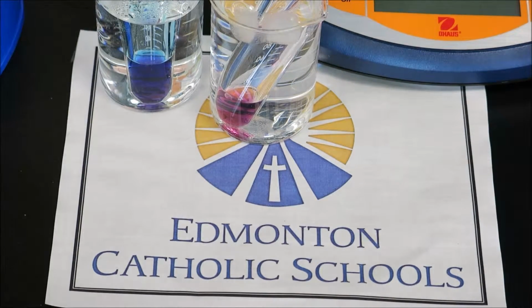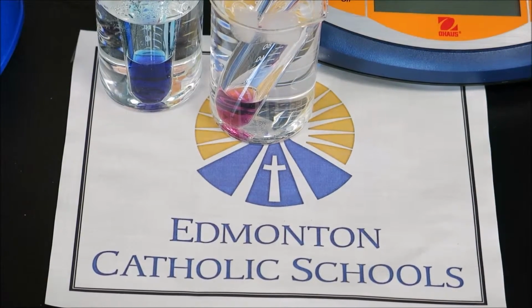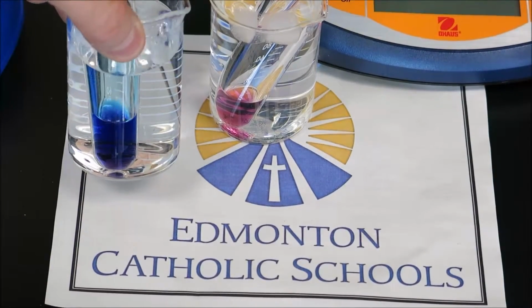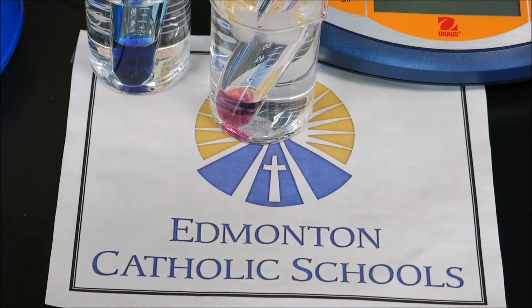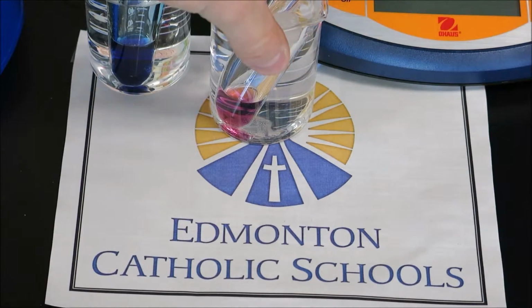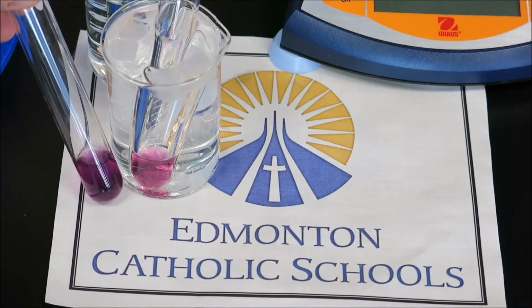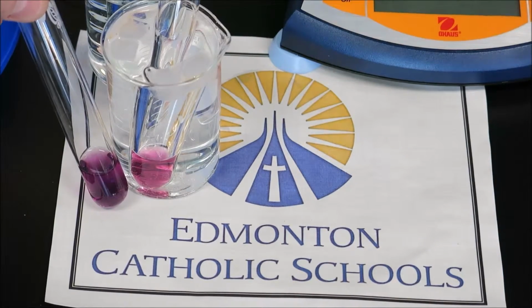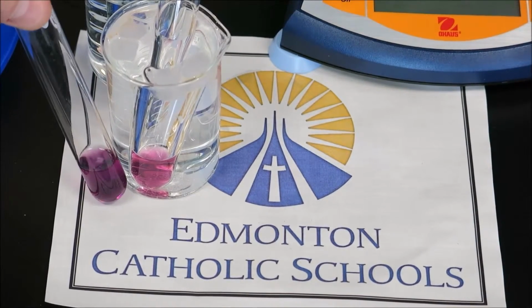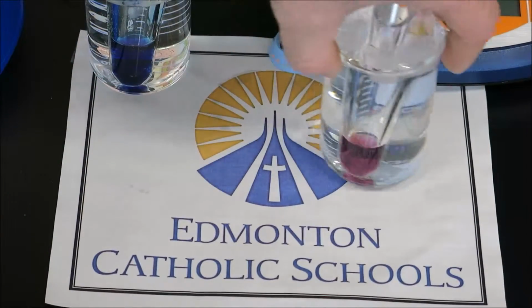In our second test here, we are going to create also a color change with cold water. So we can already see the hot water has changed. Here's our control, and there's our hot water. I think what is pretty obvious here is that the hot water has changed the system to blue. And you can take a look at your equilibrium reaction and decide if that shift is to the reactants or the products. For the cold water, it's typically a little slower for a change, but I think it is possible already to see that there has been a shift away from purple towards the pink spectrum. Okay, and we will leave that in the cold water and take a look at that in a couple seconds here.